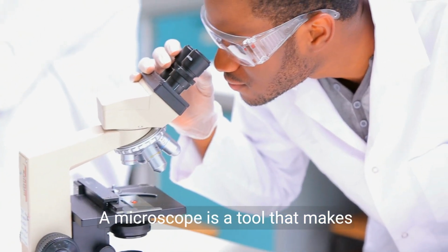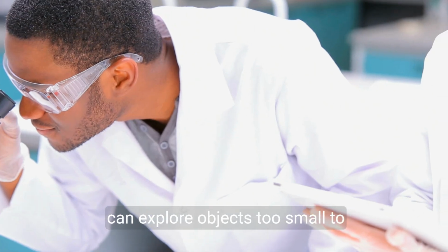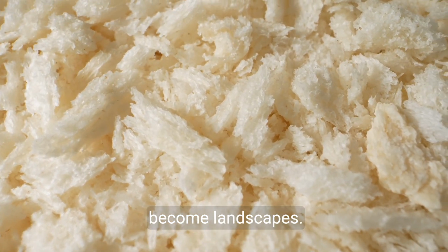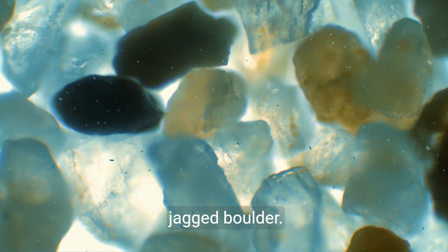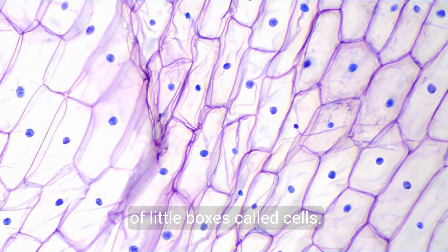A microscope is a tool that makes tiny things look larger, so eyes can explore objects too small to see alone. Under the lens, everyday crumbs become landscapes. A grain of sand turns into a jagged boulder. An onion skin can show neat rows of little boxes called cells.